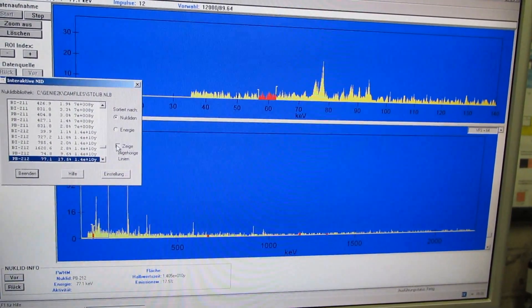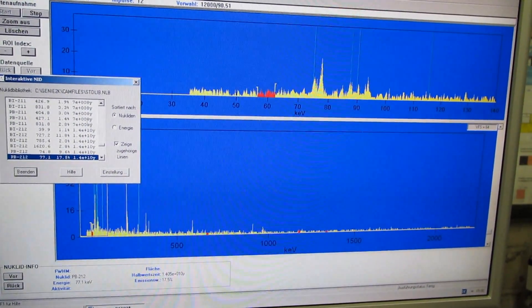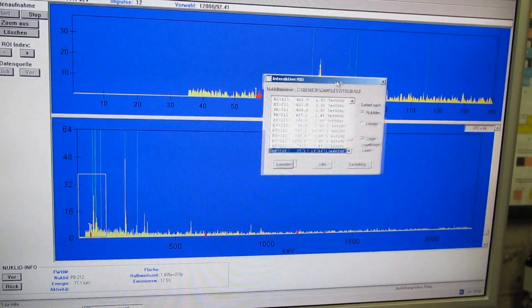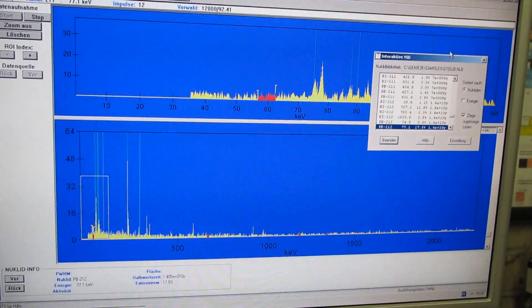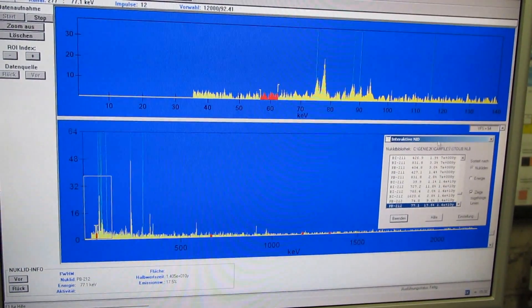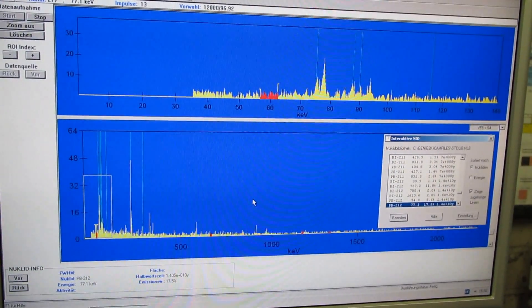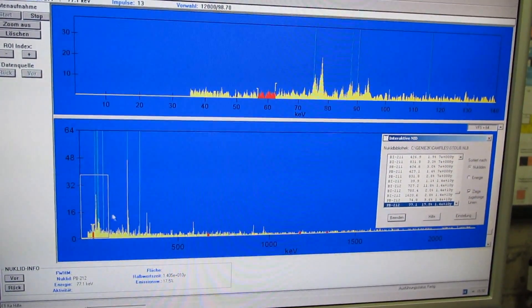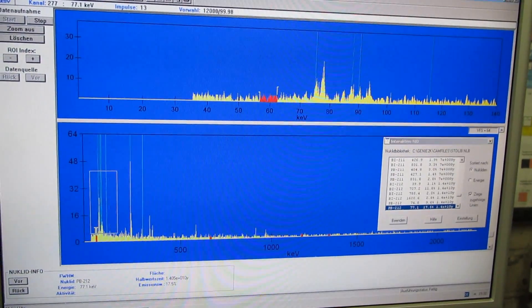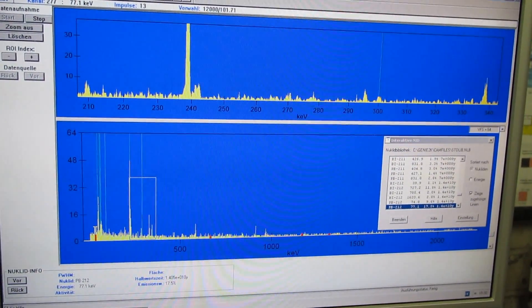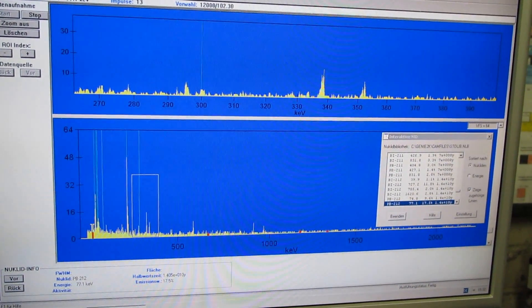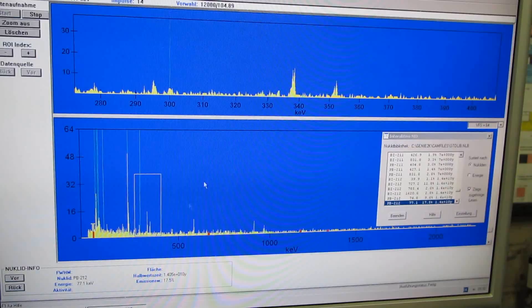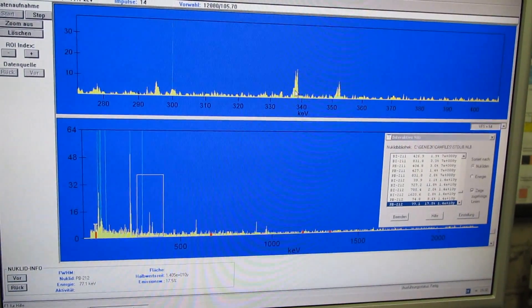Here we're just displaying all the lines that belong to lead 212, and you can see we have a perfect match. Pretty much all the lines, the gamma energies that are associated with lead 212, occur in the spectrum. So that pretty much proves that this is actual lead 212.